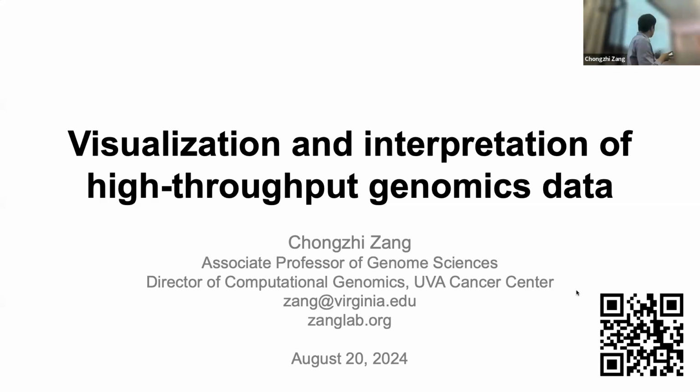So the second lecture this morning, I will be talking about how to read and analyze high throughput data. So, visualization and interpretation of high throughput genomic data.